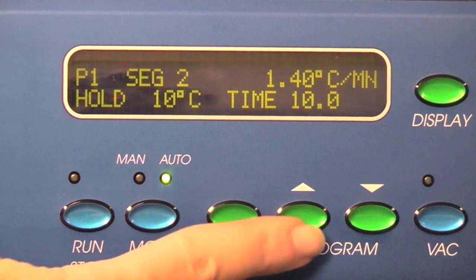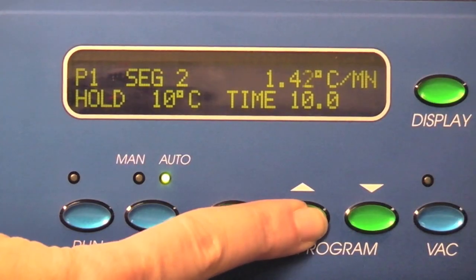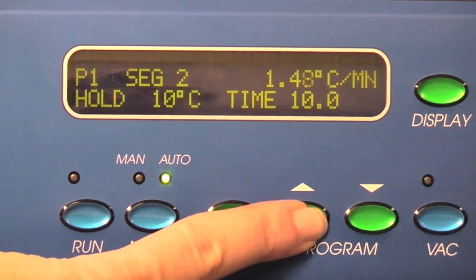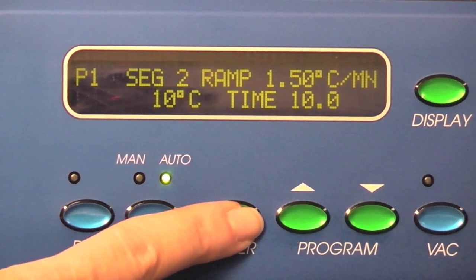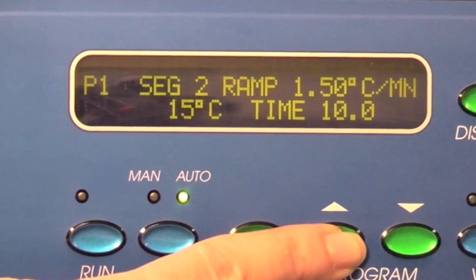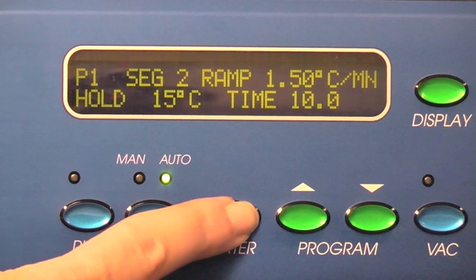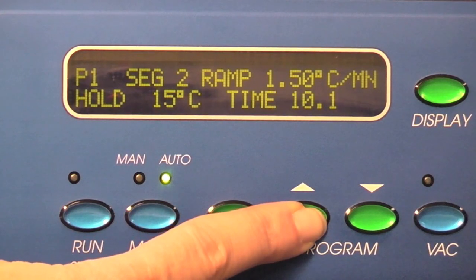You are now in the secondary dry cycle and will add heat to the shelves to drive off any residual moisture. Push enter until ramp is blinking and enter 1.5 degrees per minute. Push enter until temp is blinking and use the up button to set the temperature to 15 degrees C. Push enter again until time is blinking and set the time to 12 hours.